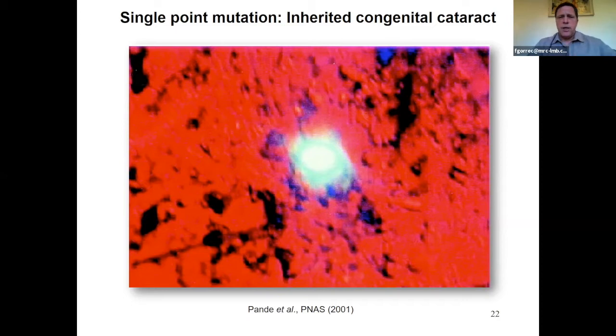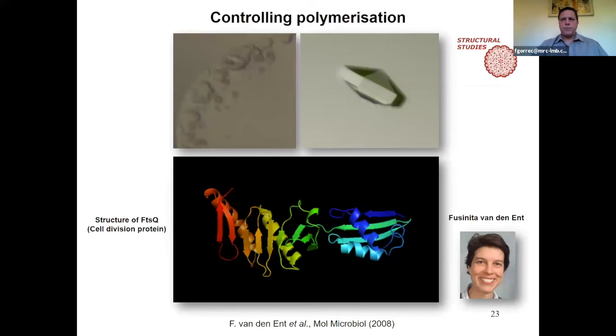That's just an example of what can trigger it. But a single mutation usually is not going to make a big change in your crystallization, but it's something that will be used later during the optimization step. Usually you will need more.